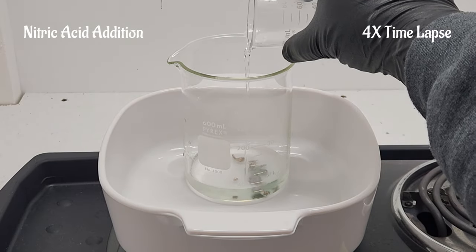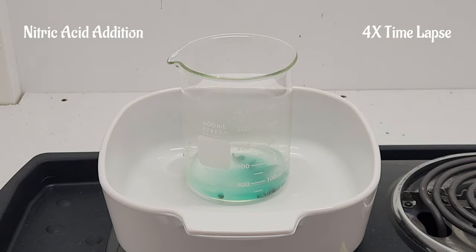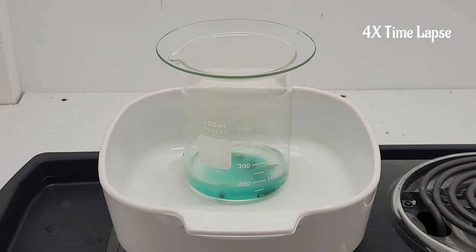These allow for quicker base metal dissolution via nitric acid due to their increased surface area. A 1-to-1 solution of distilled water and concentrated nitric acid is used for this purpose at a rate of 8.4 milliliters per gram of base metal. This reaction produces deadly nitrogen dioxide gas, which must be vented outdoors using a fume hood. Cessation of nitrogen dioxide gas production indicates reaction completion.